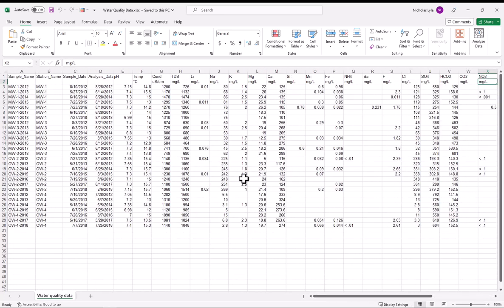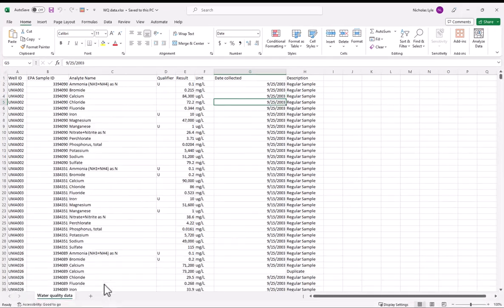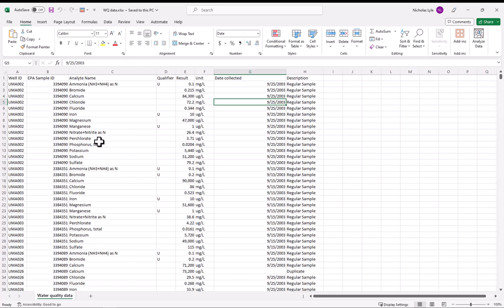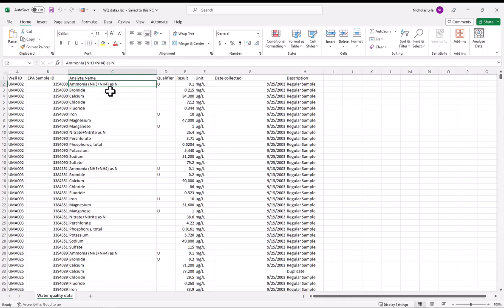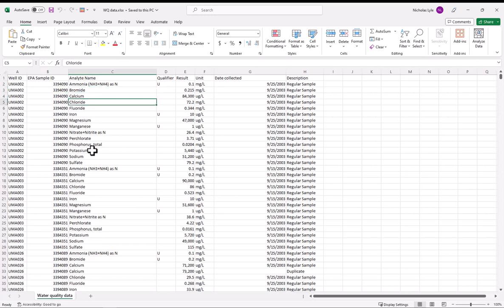AquaChem also allows you to import data where the sample results are in rows. So for an example of that, we'll look at this. So this is the data that we'll actually import. We've got the well ID. So this is the station name. We've got the sample ID. And each row here is an individual parameter result. So here, for the specific sample, we've got the results for ammonia. And then for the same sample, we've got the results for bromide and calcium and chloride and so on. And eventually, we've got results for different samples.